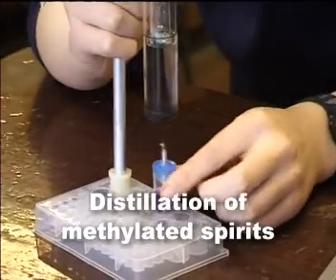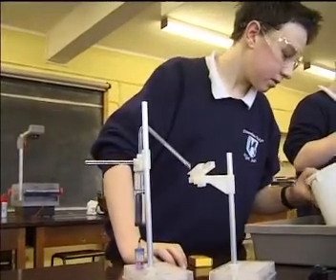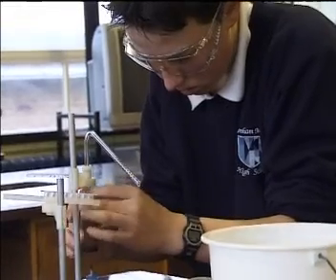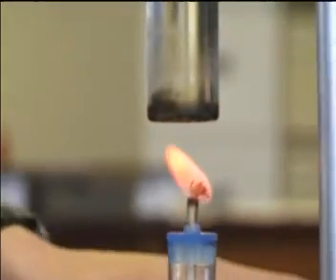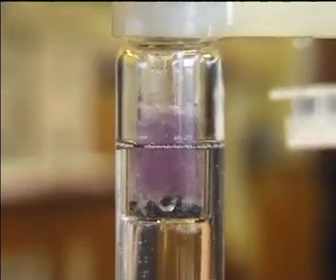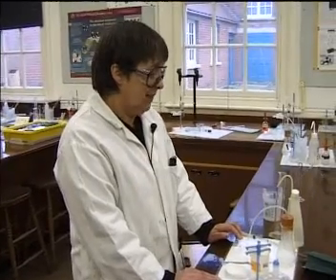My experiment, obviously, I was distilling methylated spirits. It requires 2 micro retort stands, and the way it's put up is so easy. You just literally put the retort stands in, put it on, light the Bunsen, and you're going. The larger scale distillation is much, much bigger than this one, and it takes a good 10 minutes to set up. Yes, I like it because it's small.